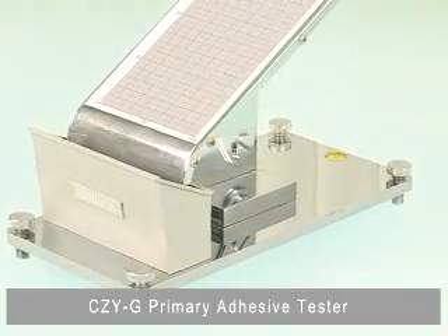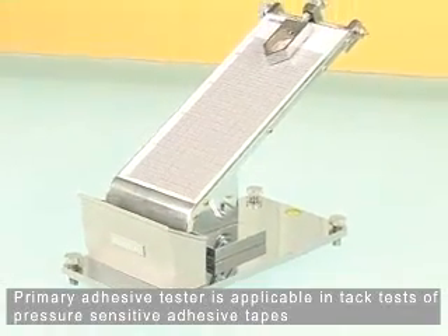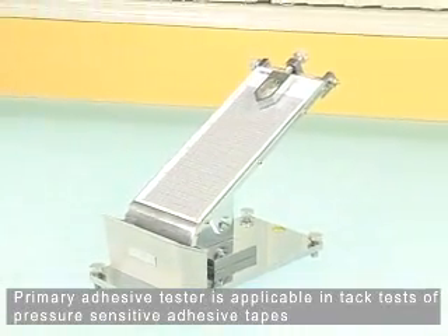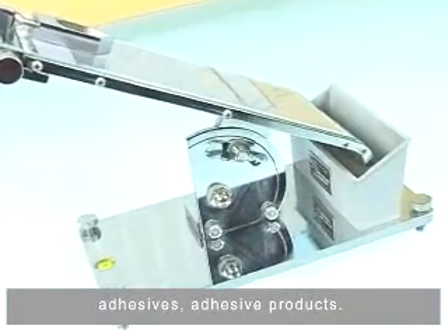CZYG Primary Adhesive Tester. The Primary Adhesive Tester is applicable in tack tests of pressure-sensitive adhesives and adhesive products.